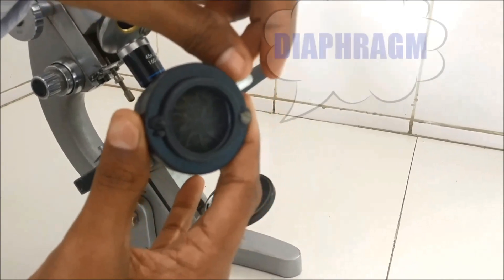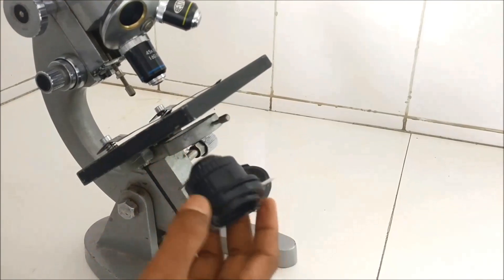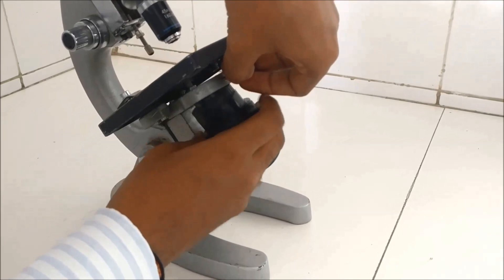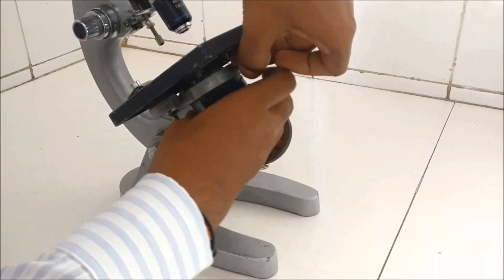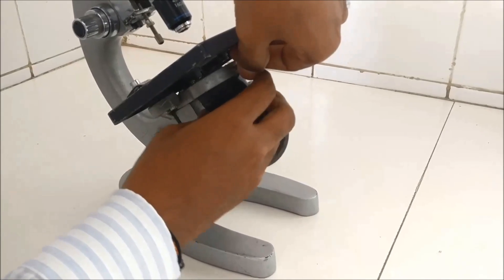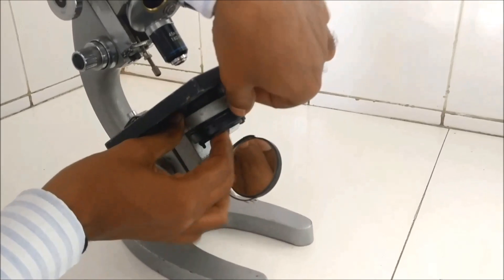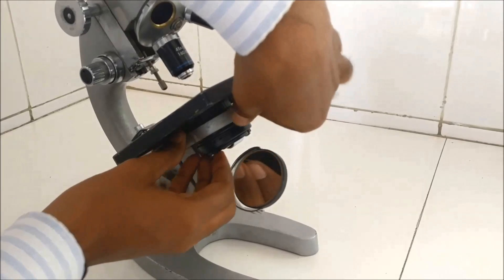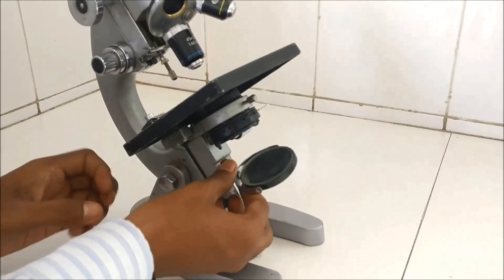The diaphragm is open when we are using the microscope and closed when we are not. If you cannot see any light under the microscope, first check that the diaphragm is open. Now we place the condenser back. At the base of the condenser you can see the mirror.